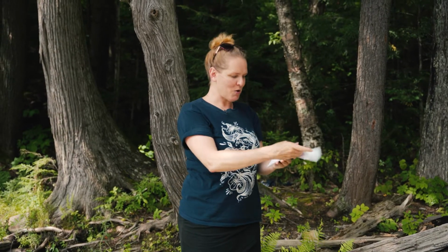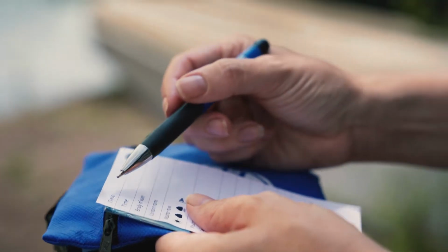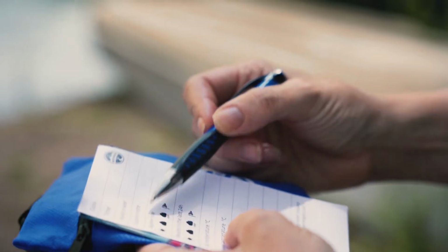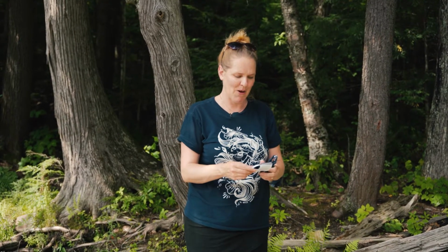If you are using our notepad, you're going to start by filling out the top section, the date, the time, the body of water, and the location name. So at this lake, we might have multiple sample locations, so we need to be more specific so that we can revisit that same spot.